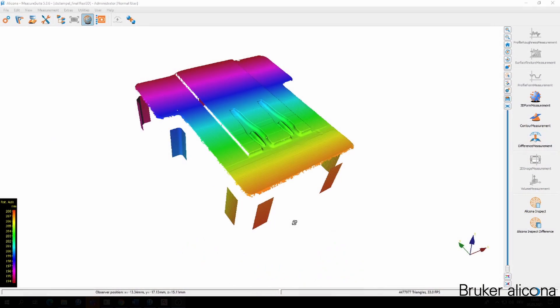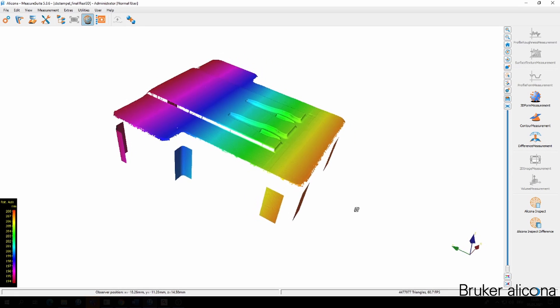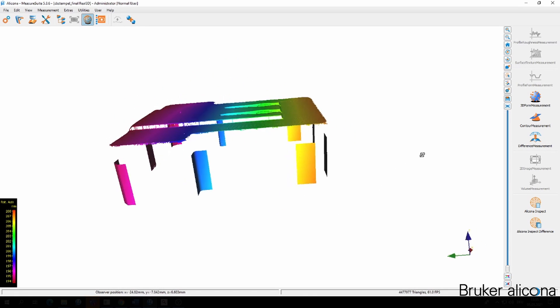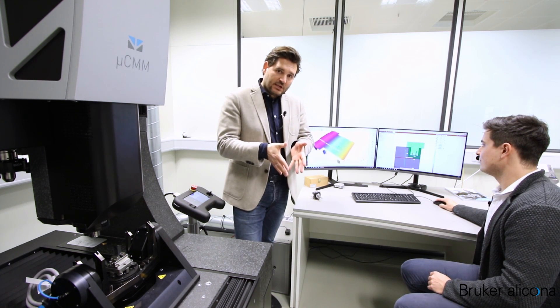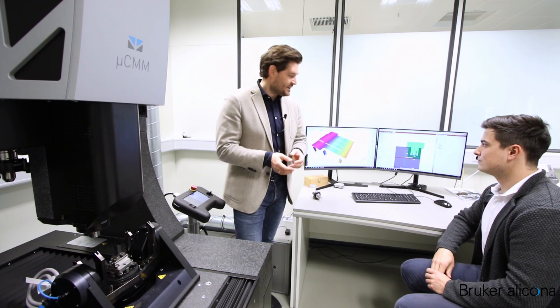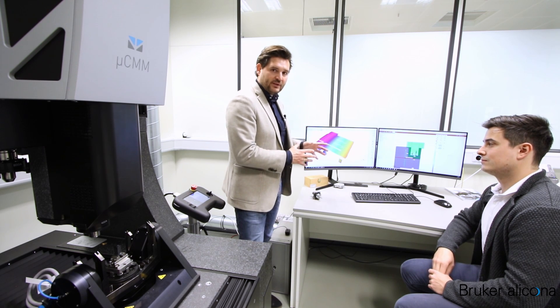The measurement is already finished. You can see the high point density data set of the surface and the vertical focus probing data sets which are covering the reference geometries. In the beginning with the Infinite Focus G5 Plus we showed how good it is to use the technology for inner geometries. Now we are showing how important it can be for outer geometries.